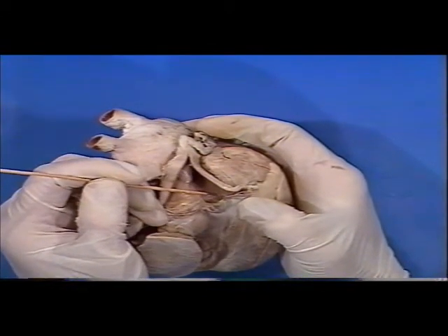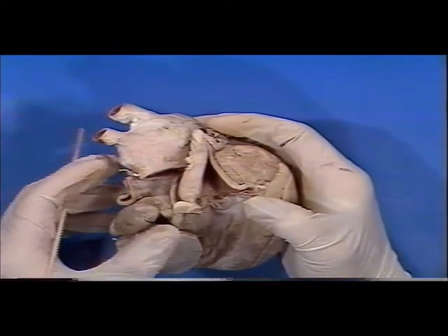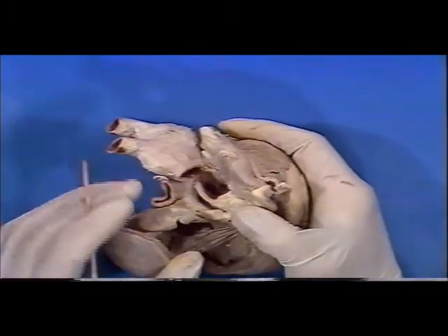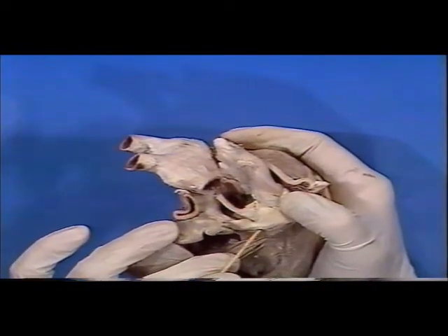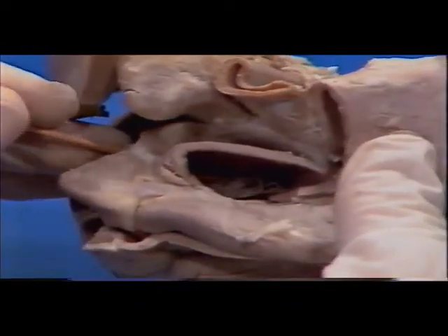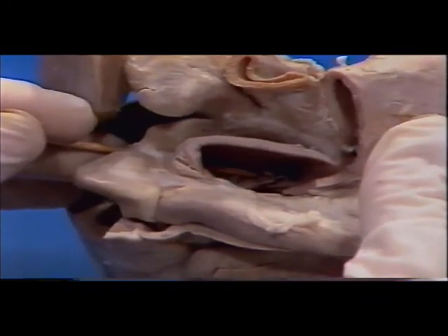It is important to try at this time to find the openings of the coronary arteries. They should be found in the semilunar valves of the aorta. The right coronary artery has been divided in this specimen in order that a probe could be inserted into the opening. We see the probe in the opening at this point, just superior to the aortic semilunar valve.